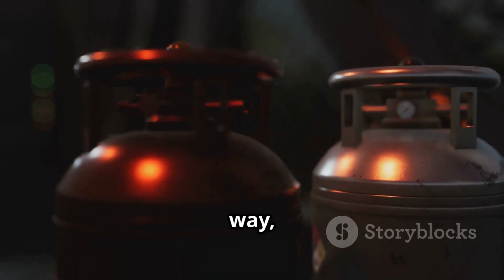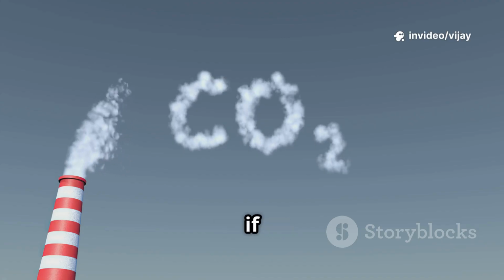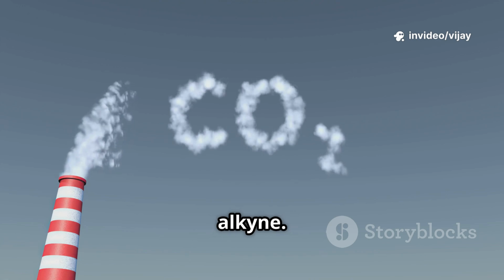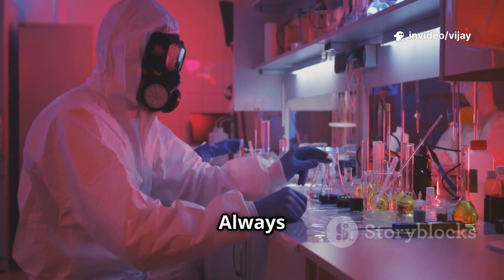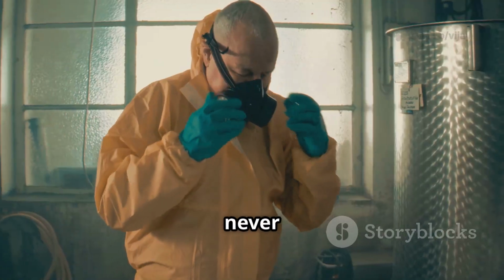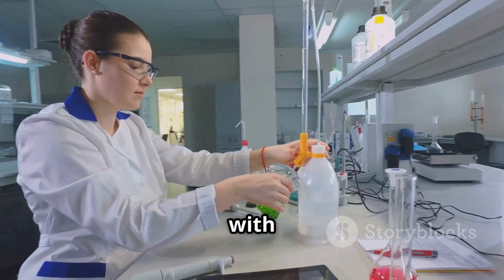For alkynes, by the way, you usually get carboxylic acids directly, or carbon dioxide if you're starting with a terminal alkyne. Now a quick but important word on safety. Ozone is extremely hazardous. Always run ozonolysis in a fume hood and never breathe in the gas. Handle cold baths, ozone generators, and all your chemicals with care and respect.